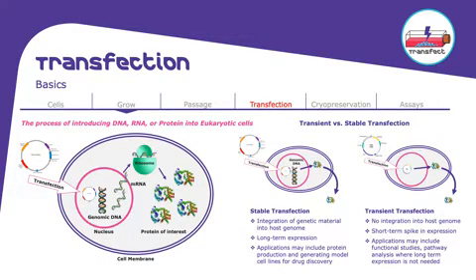And we have two types of transfection: stable transfection and transient transfection.